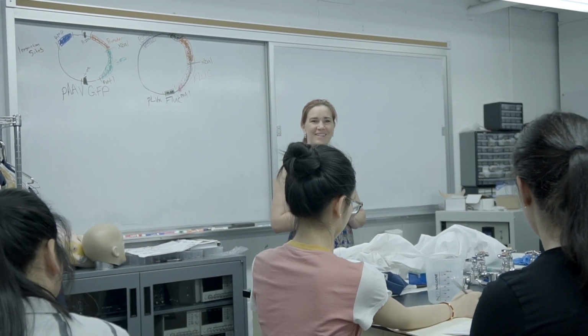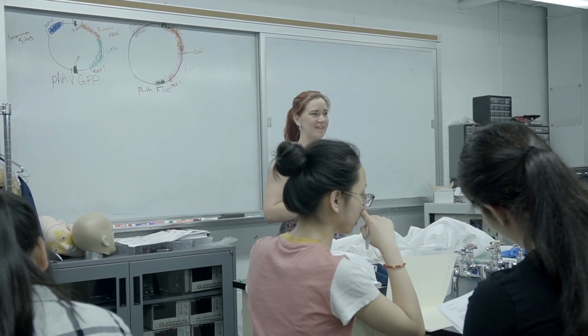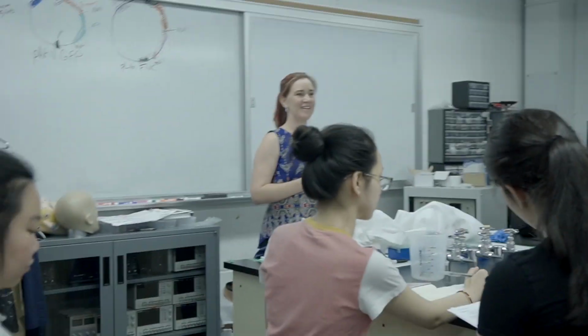It's in your notes, maybe. Anyone have their protocol handy? Yes? BglI was the restriction enzyme we used. So does anyone know how many cuts it made in our DNA? It made 2 cuts, right.